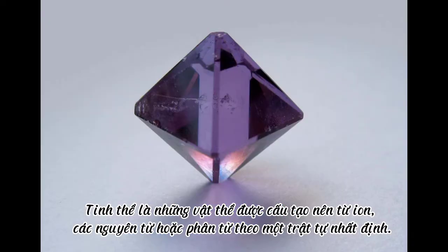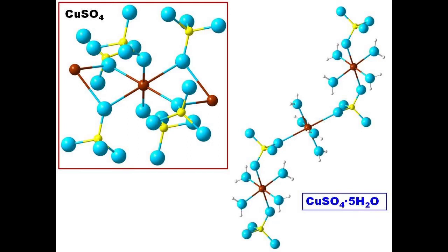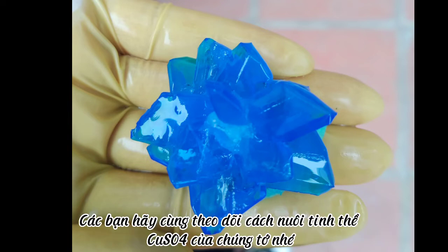Crystals are objects that are made up of ions, atoms, or molecules in a certain order. Each type of crystal has a different structure, and in this video, we will show you how to grow copper-2 sulfate crystal. But not like normal growing, we will show you how to grow single copper-2 sulfate crystal into flower shape. Now, let's get started.